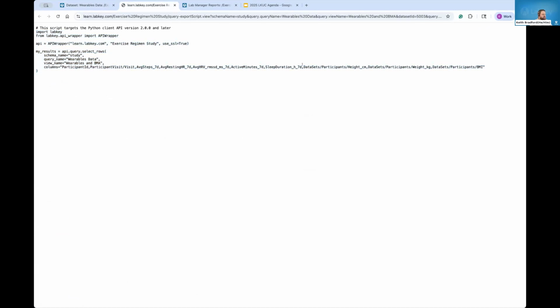And you can see here, apologize if that's small, it's included the data that I've pulled over from other data sets. And without me having to know the exact syntax, without me having to look up whether I did underscores or camel casing for the field names, it's pulled all of that data and it's ready to go and available for me to start generating the reports that I need.